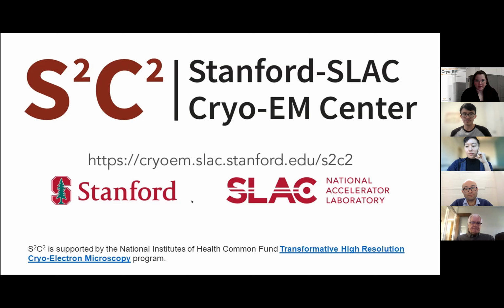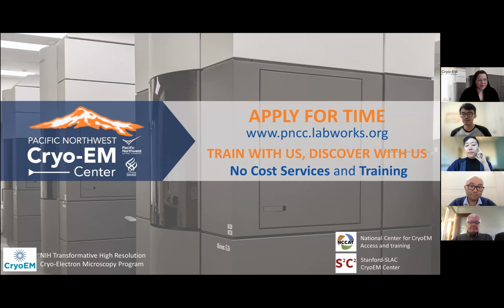Thank you, Mike. So I'm going to go next for PNCC. So we now offer 2 proposal types. So we have a screening access for up to 5 days of sample preparation optimization targeted to low resource institutions. Then we have our general access for single particle analysis or tomography, which gives up to 480 hours a year and valid for 2 years. So approved general access proposals are eligible for our training workshops. And we have a monthly submission deadline for each application, so we do accept monthly. And each approved proposal will be delegated what we call a SPOC, or a scientific point of contact, who you can ask scientific questions to.